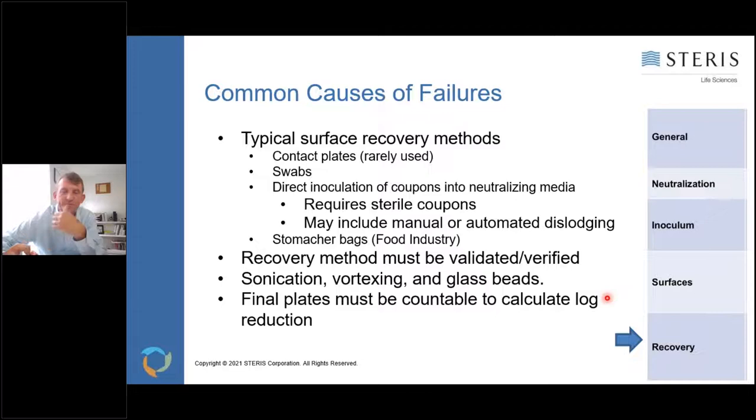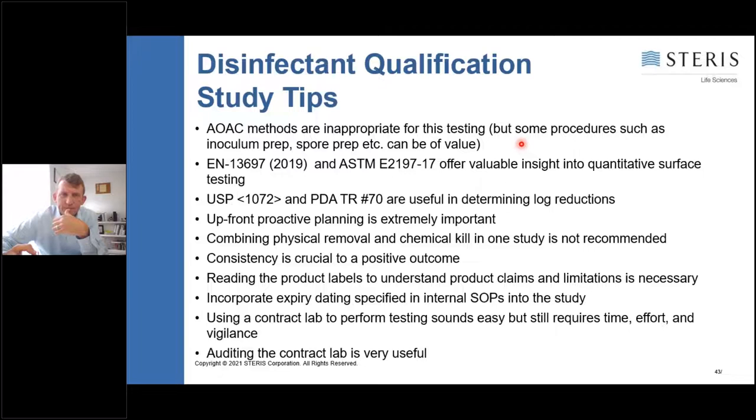So to wrap things up, again, microbiological coupon testing can be very complicated, can be very labor intensive, and there can be a lot of challenges that you need to think about up front. So upfront proactive planning is extremely important. As mentioned earlier, selecting the right methods.